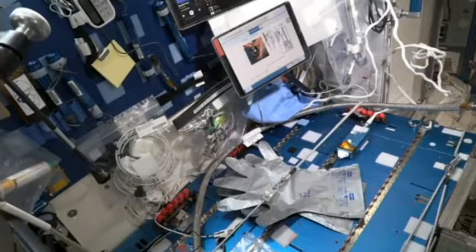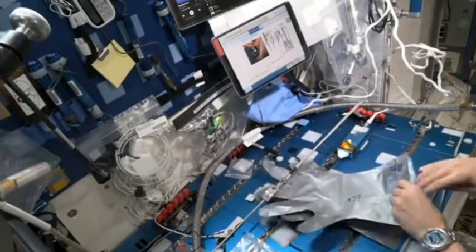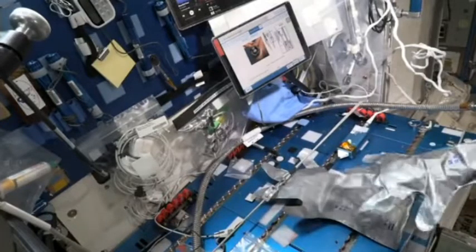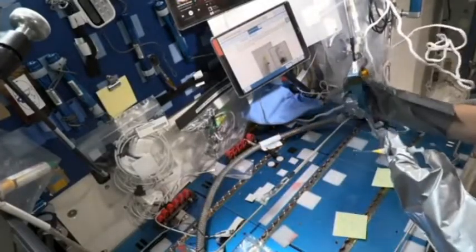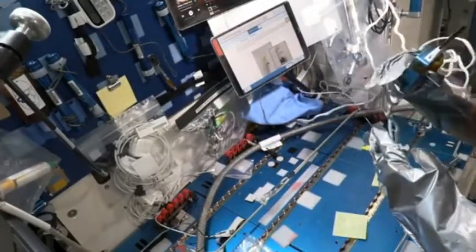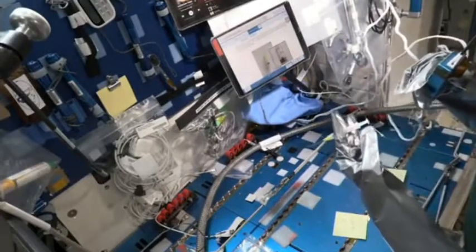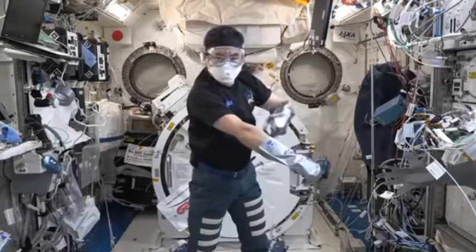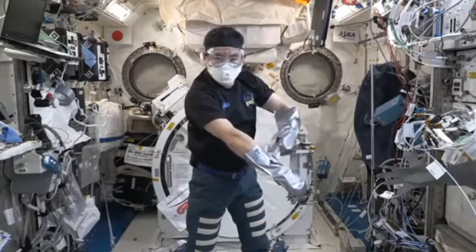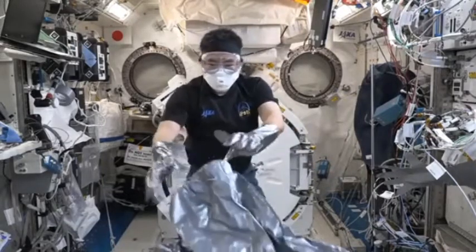Now, if we need another level of protection, we can go to our silver shield supplies. For some substances, we actually have to put this type of glove on. It's made of a different material that's even more protected than the nitrile gloves. I love the fashion statement that they bring. If it turns out that we're so concerned that we don't even want to have any bare skin on our arms exposed, we have silver shield sleeves.